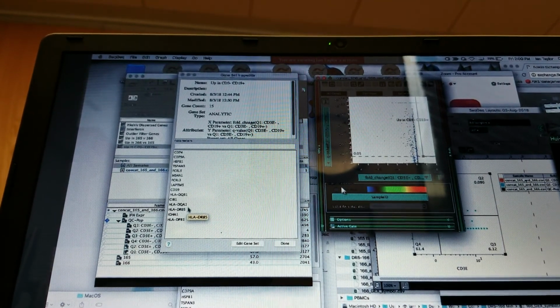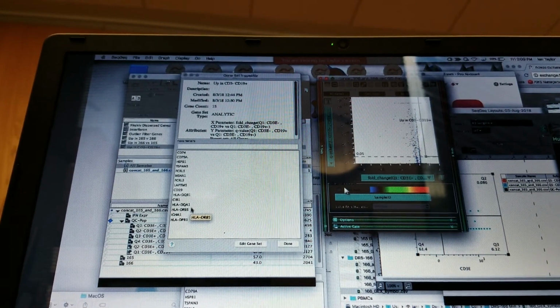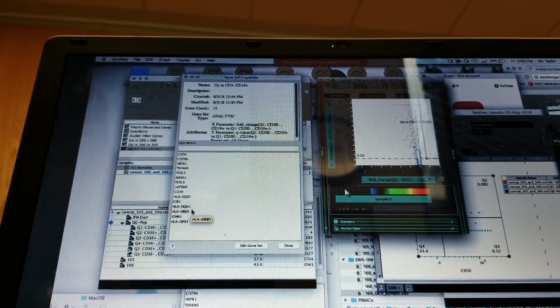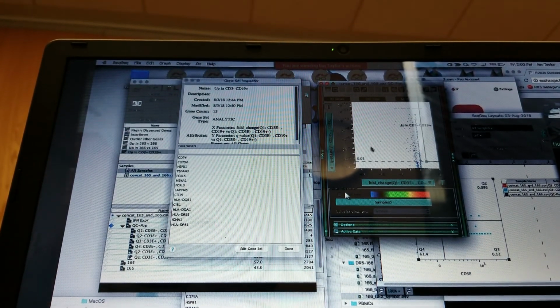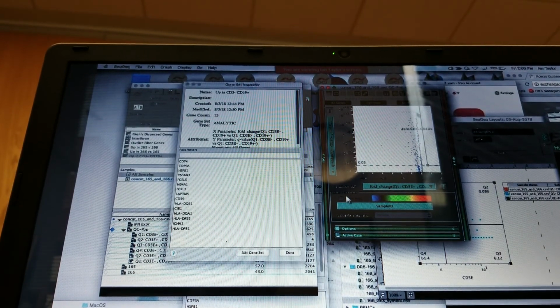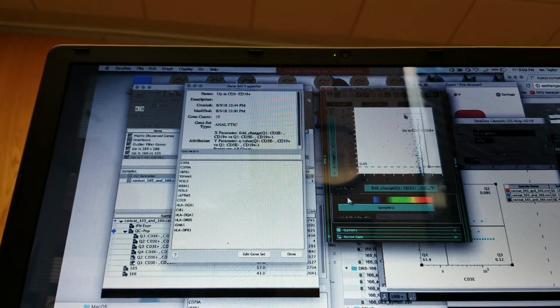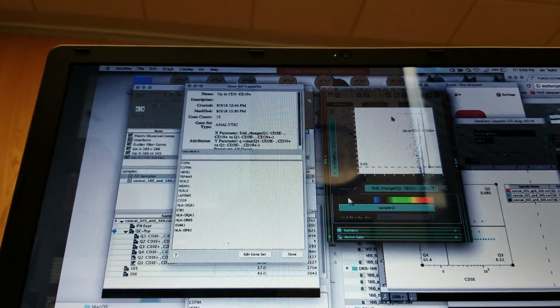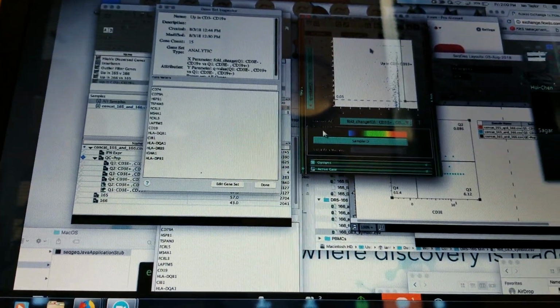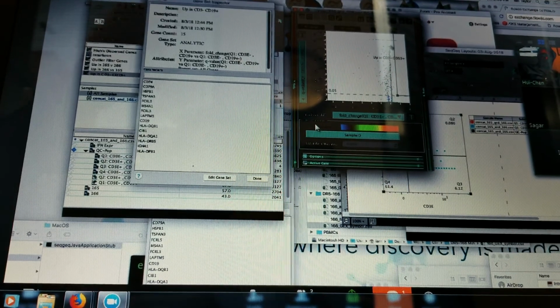So, it seems like, I don't know how many genes there are. The genes are all scrunched, all the ones up at 10 to the minus 14 or 13, something like that, at the top. Yeah, you're talking about this line here. That is artificial. This is not biologically true. This is right where the algorithm to calculate adjusted p-values runs out. So they're up higher than that, but you don't care.